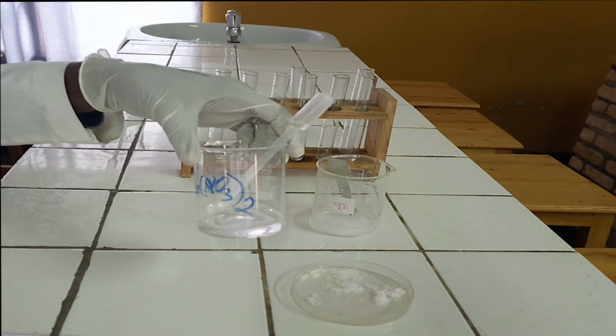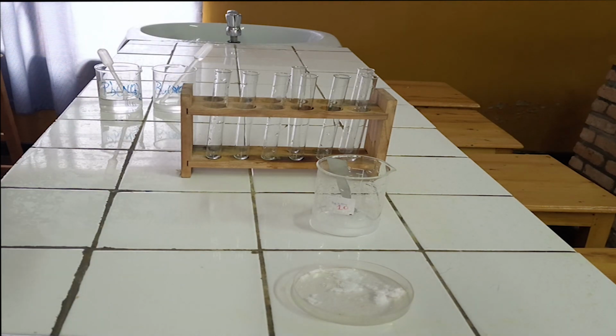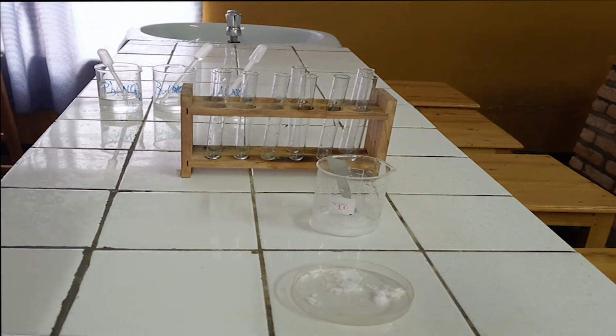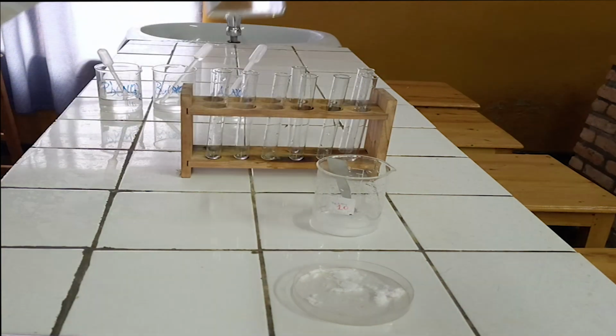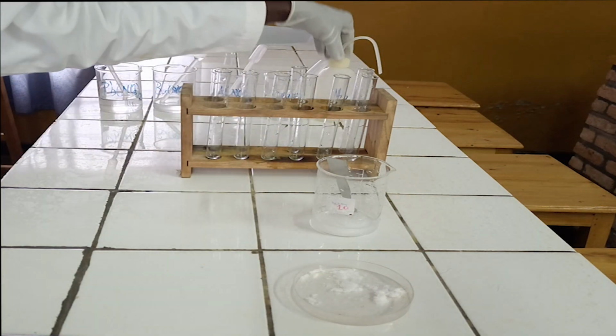2. Barium nitrate solution. 3. Silver nitrate solution. 4. Diluted nitric acid. 5. Ammonia solution.